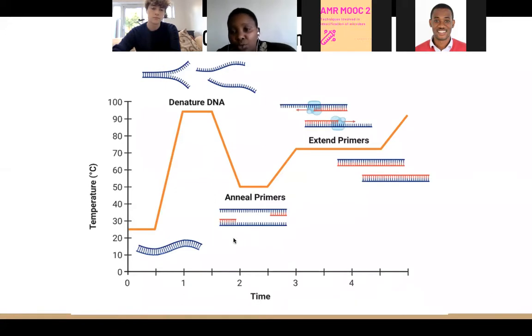So when you go to amplify it, you just do it by a primer. This is a short oligonucleotide sequence, which is used to initiate amplification of a DNA of interest. So let's say you have a mixture of 1,000 DNA samples from different sources. Now you just want to amplify that of interest. So from there, you go ahead and design a sequence which will initiate amplification of only the DNA of interest.